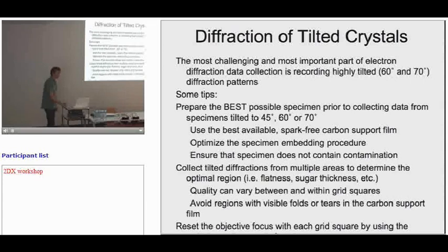Why do we use it? Yeah. It gives much better data. The quality of the resolution, the sharpness of the spots are all, in my hands at least. It may be different in someone else's hands, but for me, it's always 30 to 50% better with the sandwich.